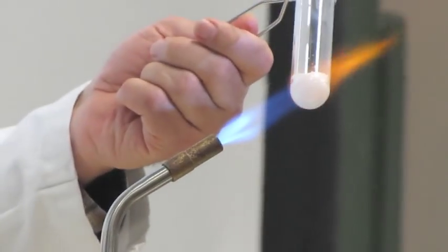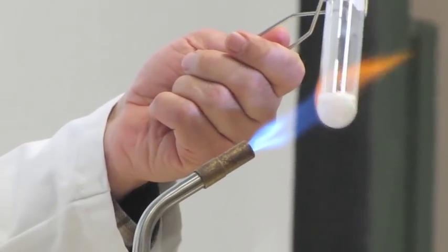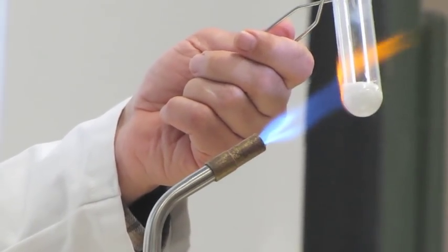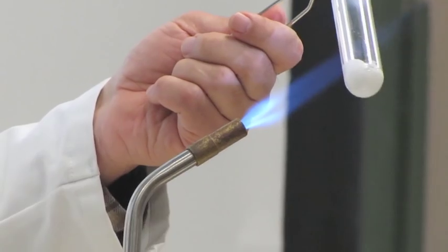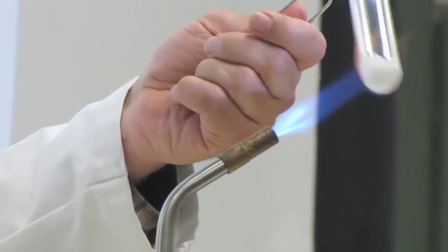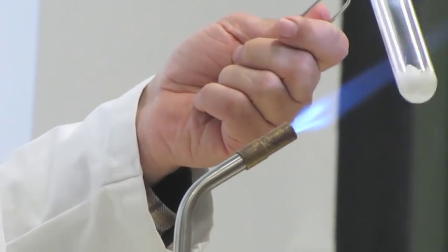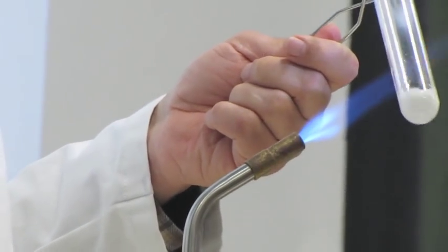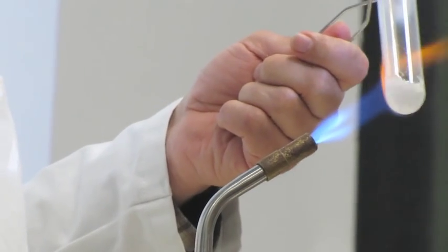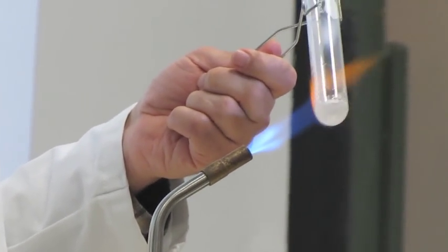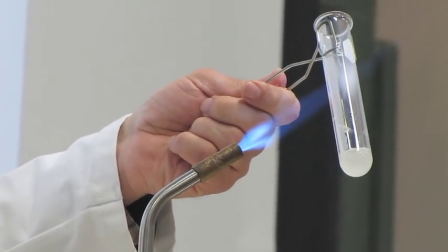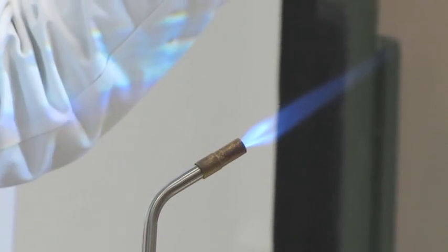So, I already see the difference. What physical property are we discovering for potassium chlorate as opposed to potassium chloride? Lower melting point. I can melt it with the propane. Propane flame is hot enough to melt it. You guys see that's liquid? Yeah.